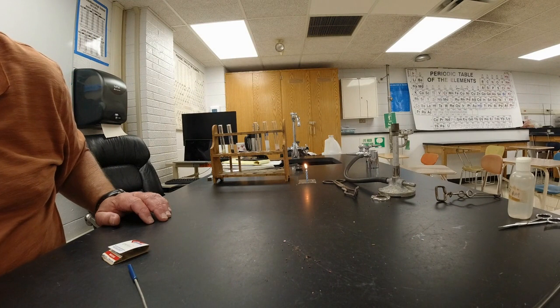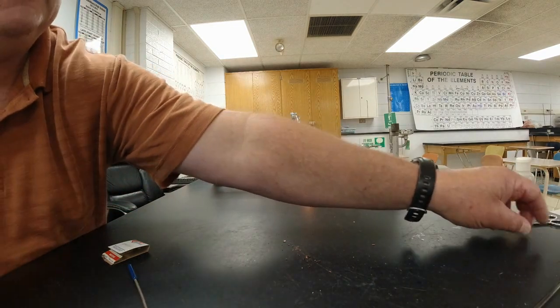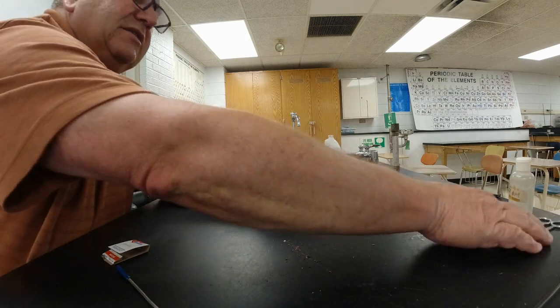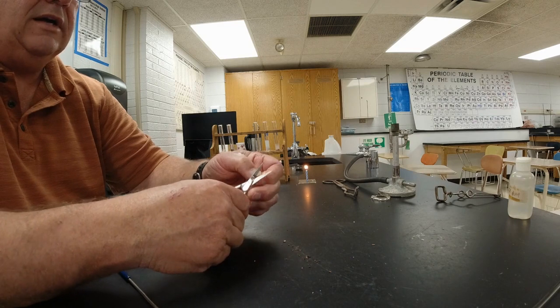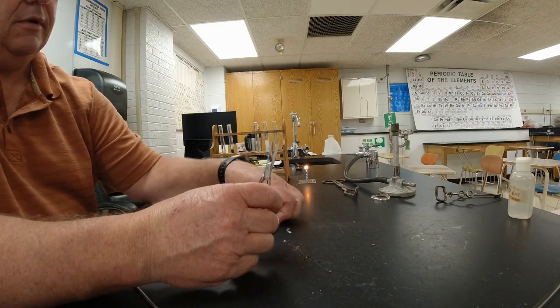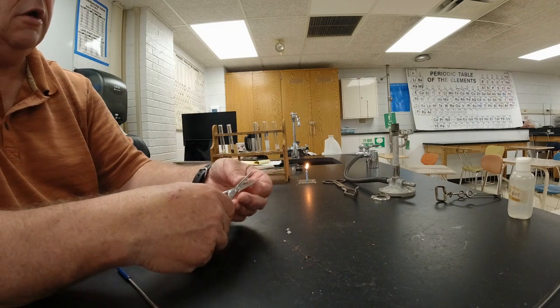All right, in part number 5, if you go to step number 5 in the procedure, it says take a piece of magnesium ribbon. You guys have seen me burn magnesium ribbon before. There's a magnesium ribbon, and it says to tear it into pieces. Now, this is kind of thick, so instead I'm going to cut it into pieces with a pair of scissors, and because this is so thin, just like aluminum foil would cut real easy, I'm going to cut this up. And let's cut one more here.